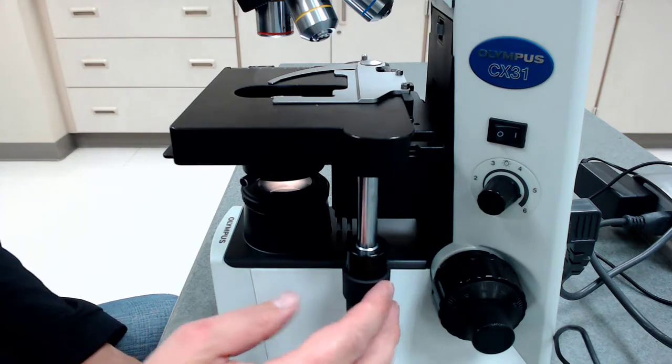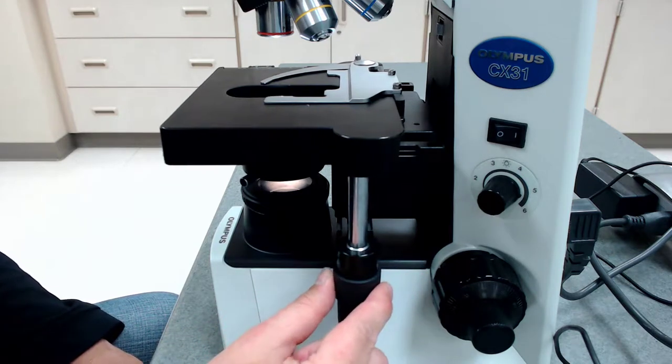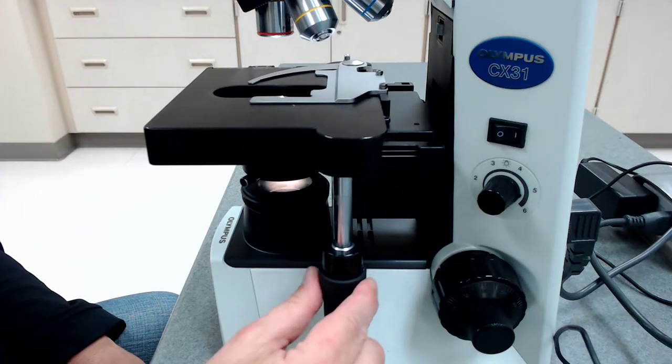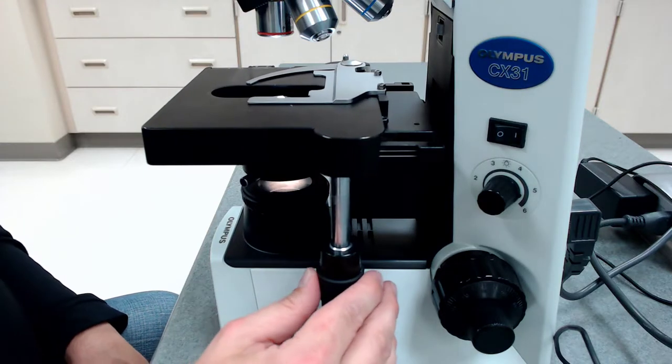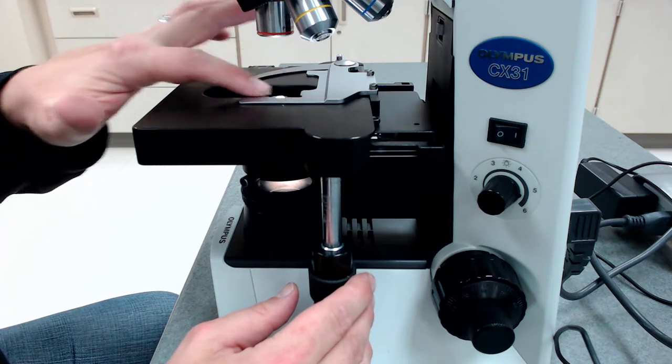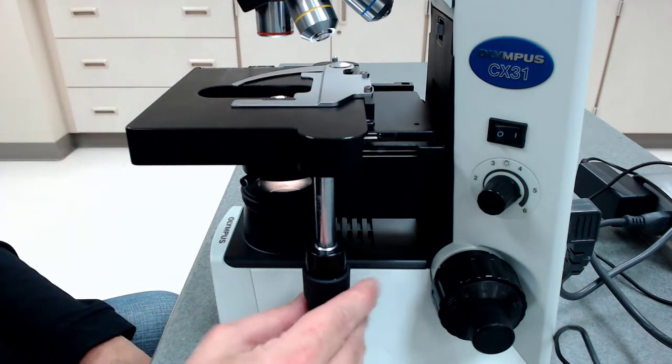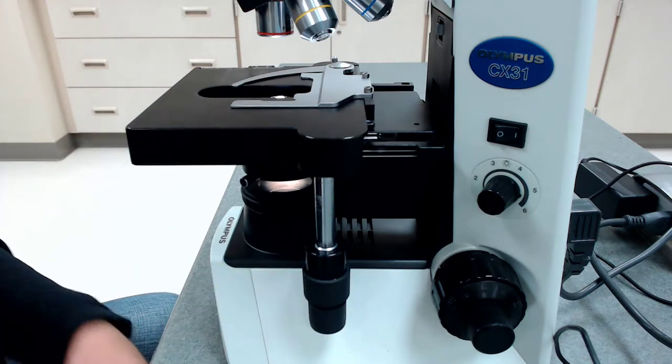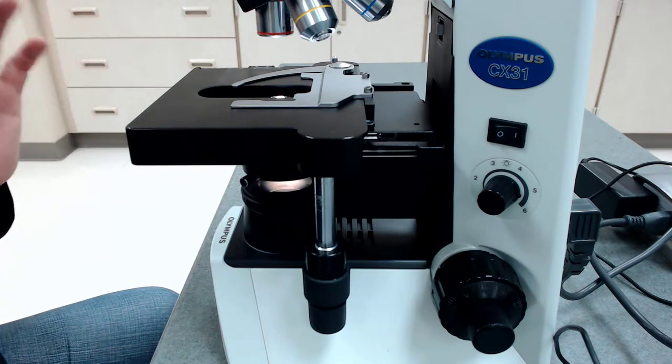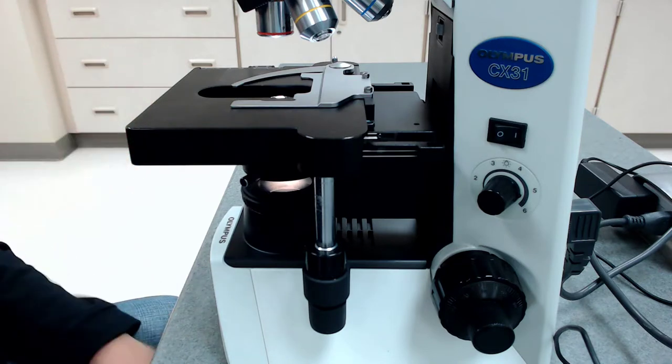And then use these knobs here that you can see at the bottom to move the stage forward and backwards and right and left. So you actually will put the slide all the way inside this bracket and then move it to the light source. A lot of times students will try to put the slide where the light is. And that can be a big problem. It just won't work very well.